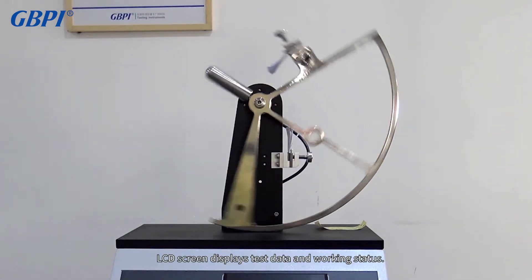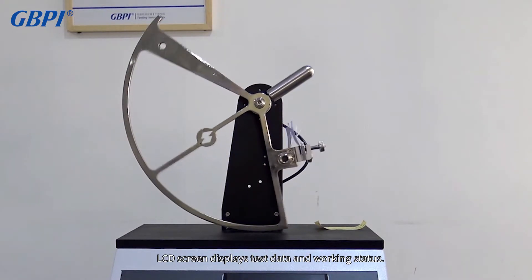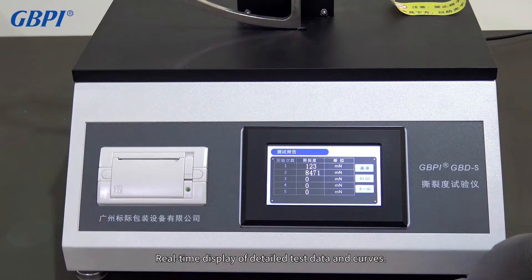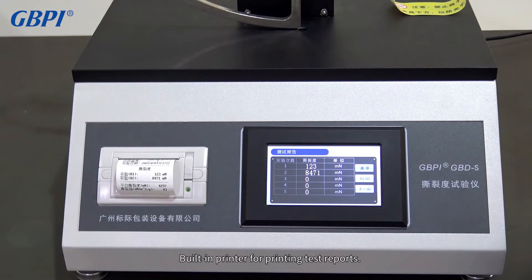The LCD screen displays test data and working status, with real-time display of detailed test data and curves. A built-in printer is included for printing test reports.